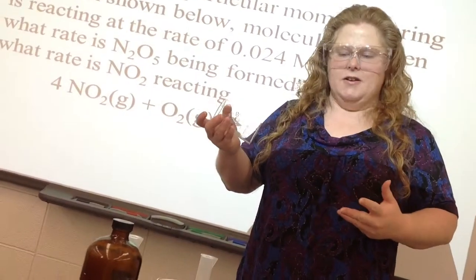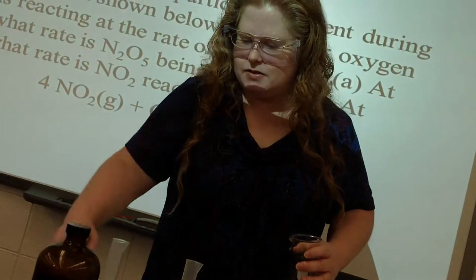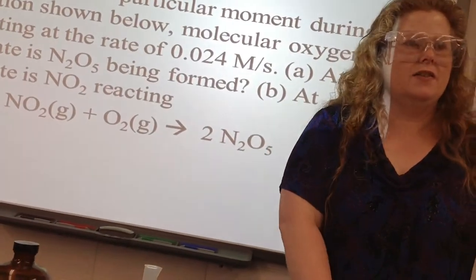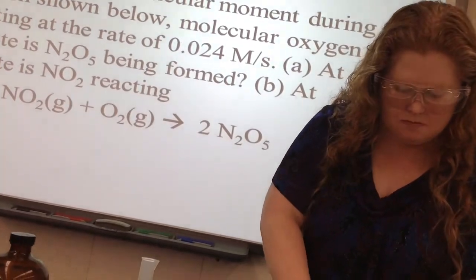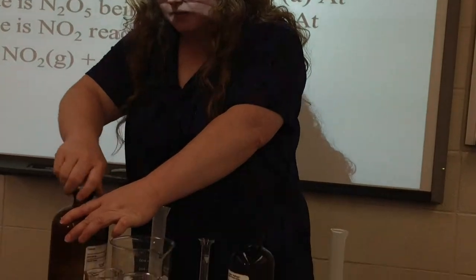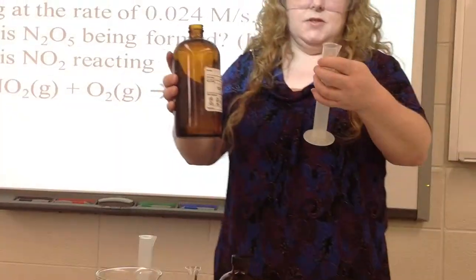So I'm going to start out by looking at the solution concentration. It's full strength, 0.02 molar. And so I'm going to put in 50 milliliters of my sodium thiosulfate.